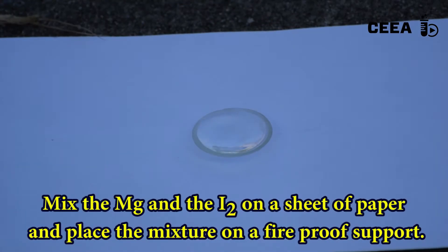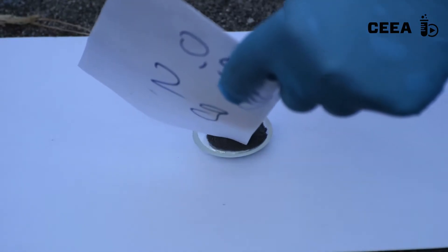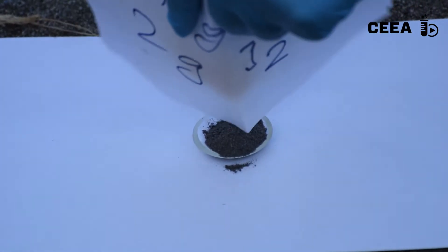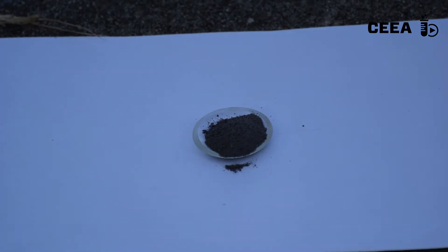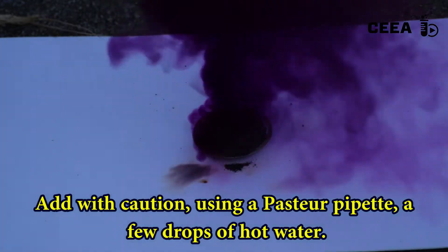Mix both reagents on a sheet of paper and place the mixture on a watch glass on a fire-resistant support. The reaction is initiated when we add a few drops of hot water.